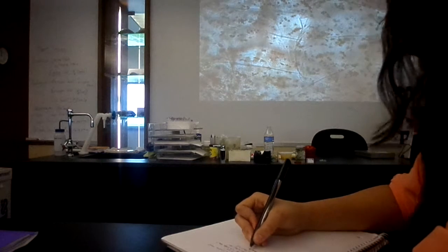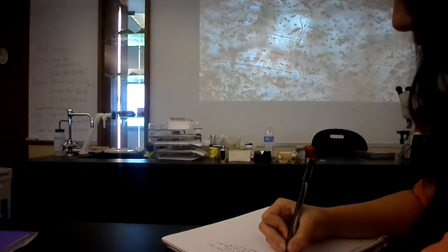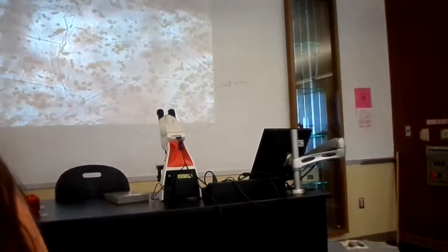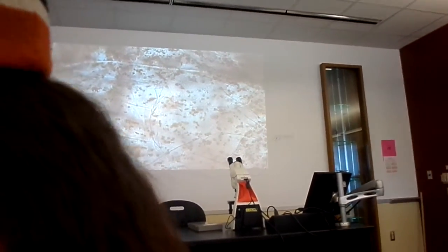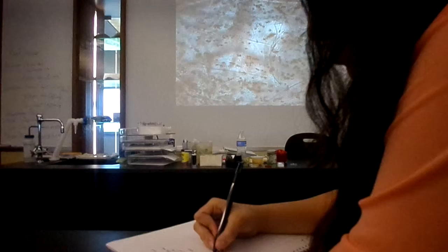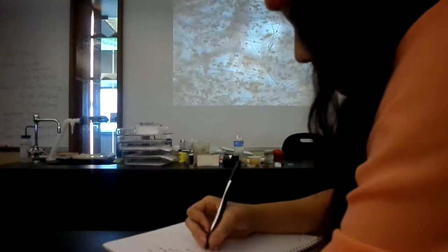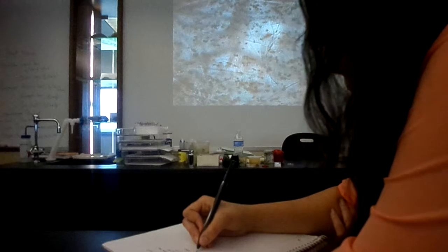First thing, the outer boundary of a plant cell is called the cell wall. So now we're looking at plants, so we have to take into consideration that cell wall now. The outer boundary is the cell wall. All of the material inside of the cell is simply going to be cytoplasm. Okay? Now on the list, it does say nucleus, but I'm not staining this with anything. We're going to see nuclei in a minute. So you're not responsible for the nucleus on this one, okay? So you can cross that off.